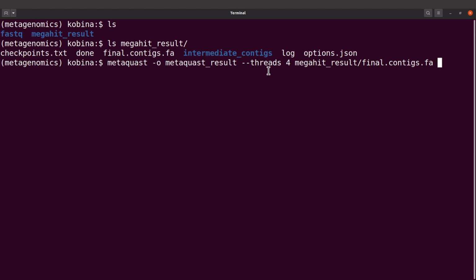So for the read mapping statistics, we need to specify FASTQ. The requirement is that you need to have enough space when you are specifying the FASTQ files, because you need a lot of space. For now, I'll use this command, but if you want to add a FASTQ file, then you have to make sure you have enough space. If you want to add FASTQ files, that's how we do it.